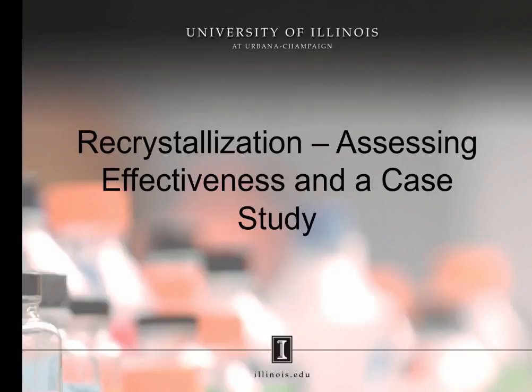Recrystallization, assessing effectiveness and a case study. In this webcast, we will discuss how to assess the effectiveness of a recrystallization. We will then apply those ideas to a recrystallization case study.